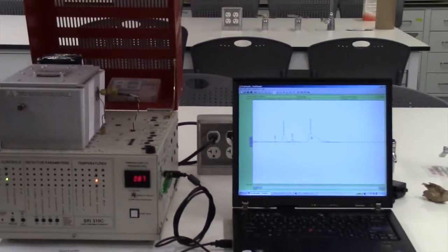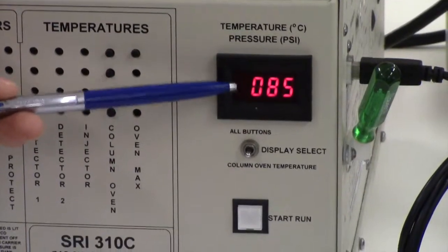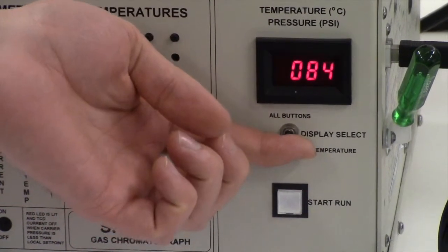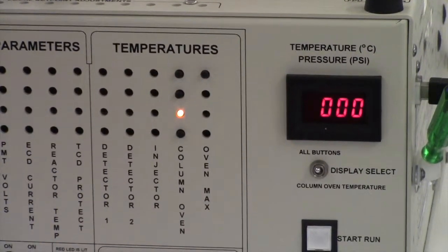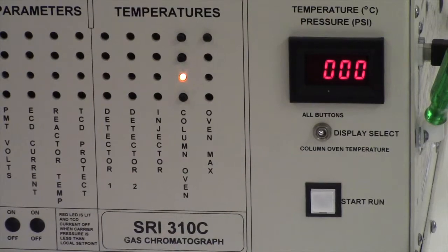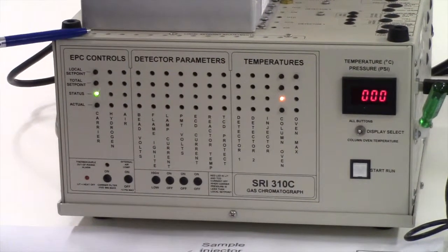So the current display setting shows us the current temperature of the column oven. So that's the main switch. Well, main setting. In this position of the toggle switch, we can see and set up or adjust some of the settings, such as the flow.